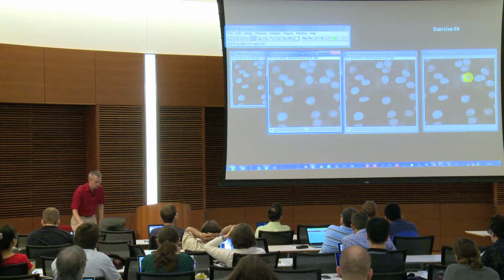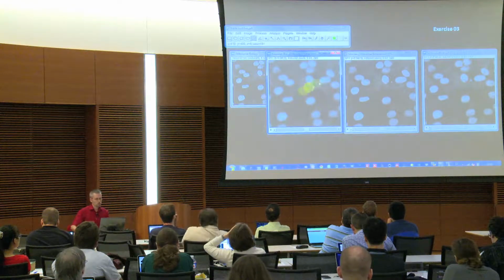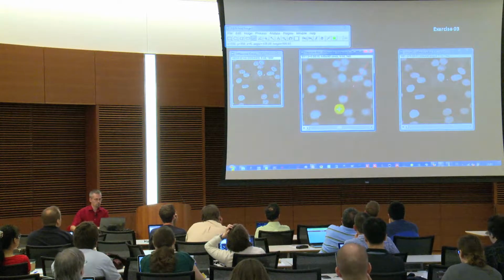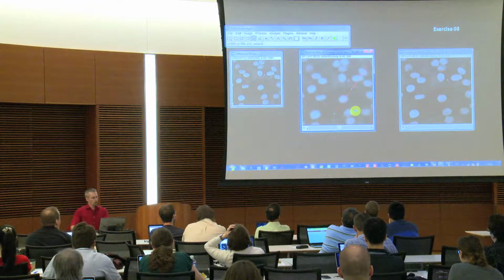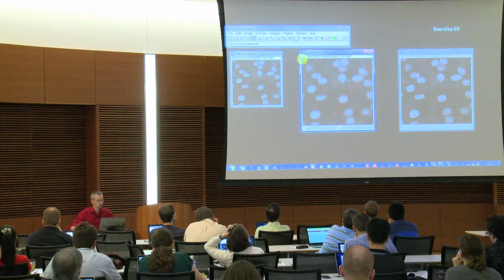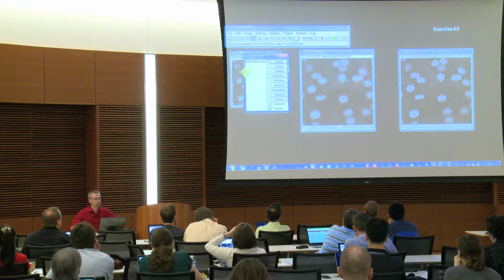So just to show you a comparison of the object size between those two, I'll make a line somewhere over a few of those cells or nuclei. I put that to the ROI manager to transfer that later on at the same position to the other image. The ROI manager, you can simply use T, which adds that to the ROI manager.